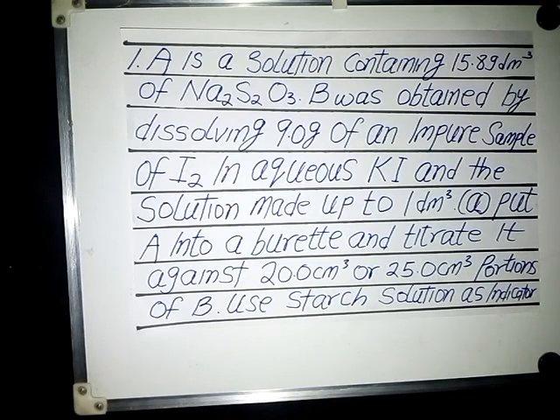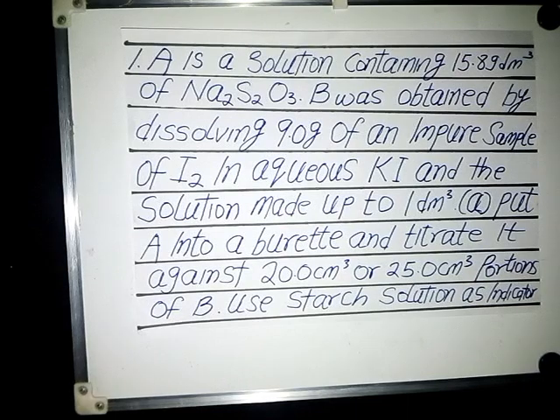So today we're going to be looking at your WAEC chemistry practical questions. I think your practical should be coming on the 14th of this month. So this video is for those taking the chemistry practical, WAEC of course. And I'm going to be looking at titration and your salt analysis.